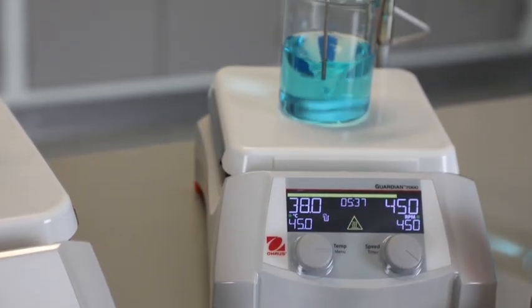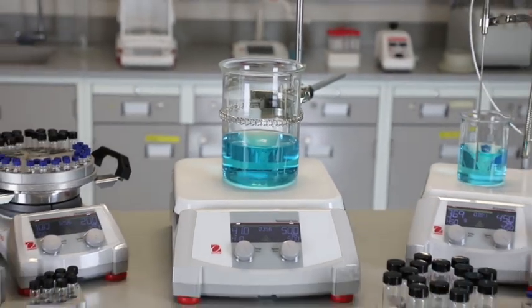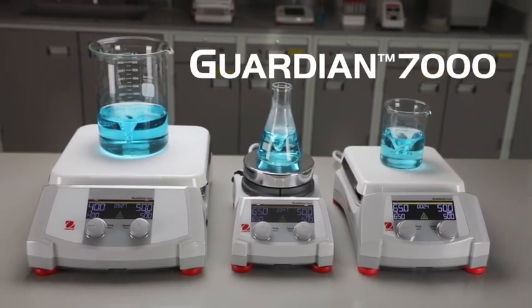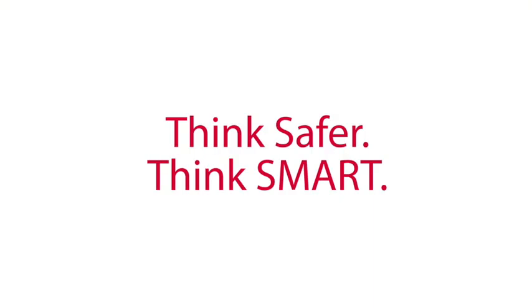With a wide range of accessories including temperature probes, specialty clamps, uniblocks, sectional blocks, and base plates, you can modernize your lab with the innovative Guardian 7000 series hot plate stirrers, designed with durability and efficiency in mind. Think safer. Think smart.